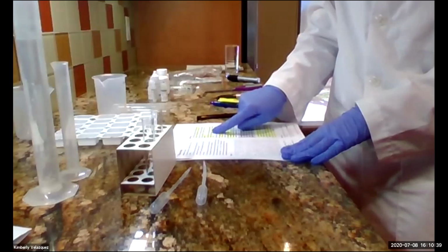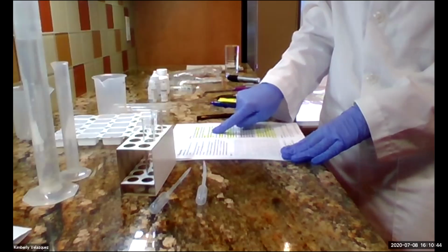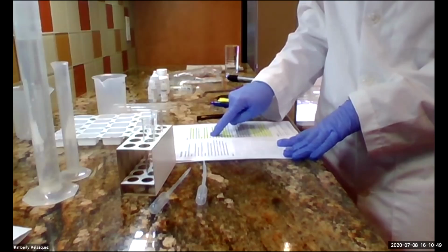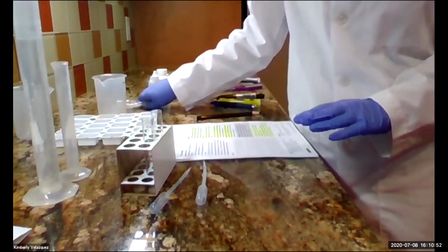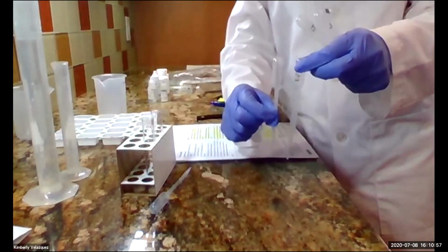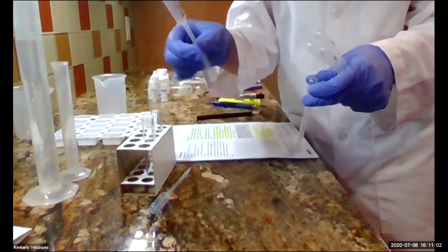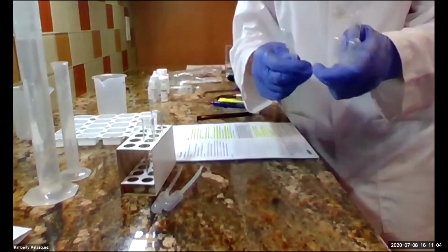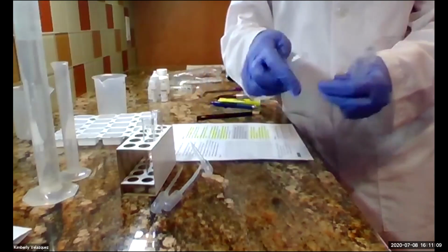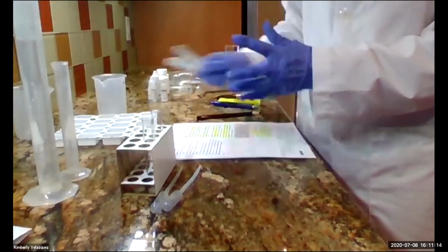Okay, now you're going to label 4 of the bigger pipettes, and you're going to label those water, pH 4, pH 6, and pH 8. Those come in your pH activity bag today, and you can see that they are fatter in diameter than the ones that came in your general equipment bag that you labeled sodium hydroxide and hydrochloric acid. Those are smaller. So this one I labeled a W for water, and then I've got pH 4, pH 6, and pH 8 that I've labeled. Okay, so I'm going to put those aside.